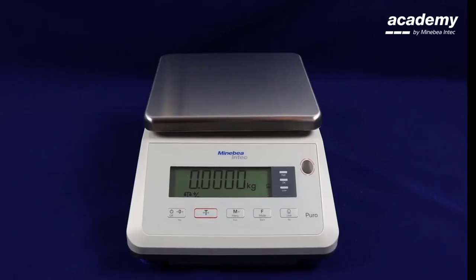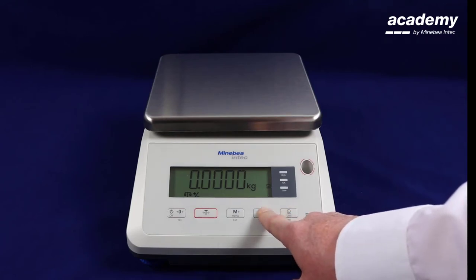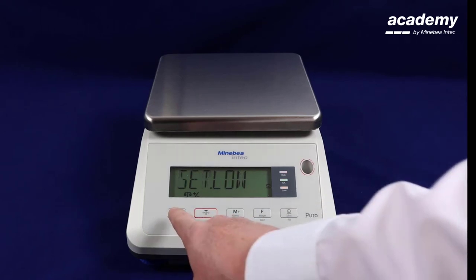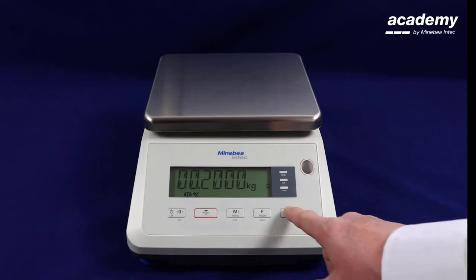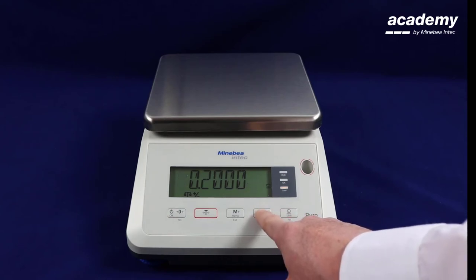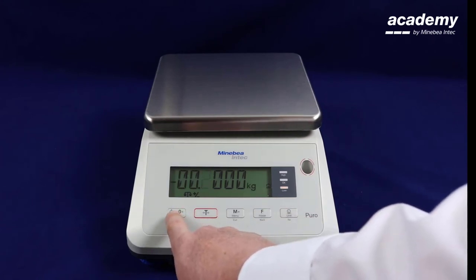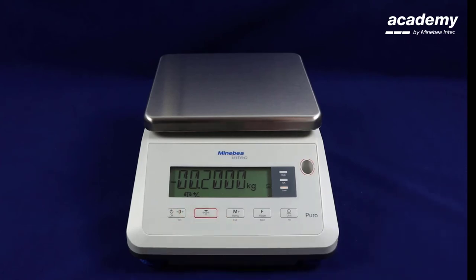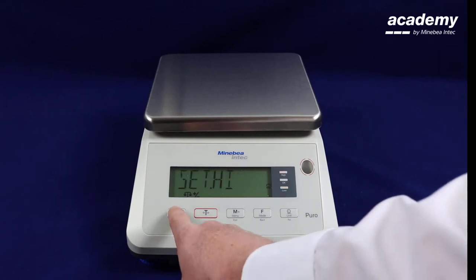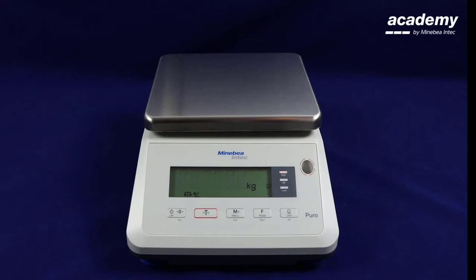We will now demonstrate negative check weighing. In this instance when you set the higher and the lower tolerance limits both need to be negative values. To do this press and hold the function key. Accept when it says clear limits. Set your lower limit. When moving across use the function key to scroll up and you can see that there is now a minus symbol. Your lower limit has now been set.